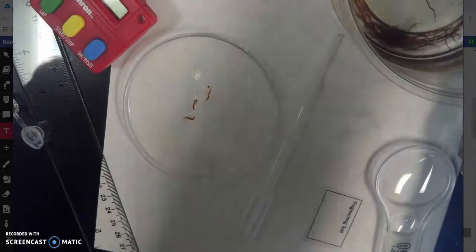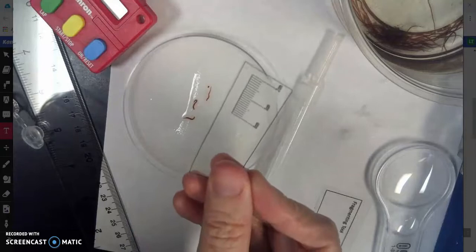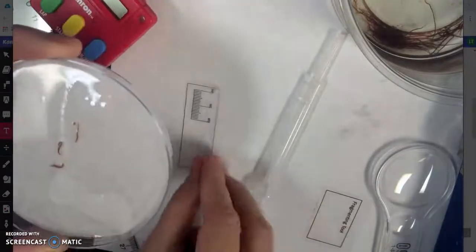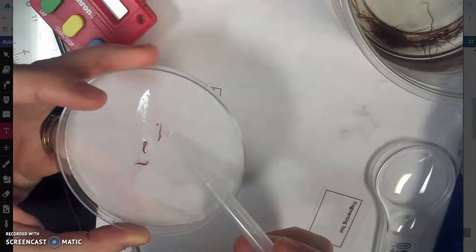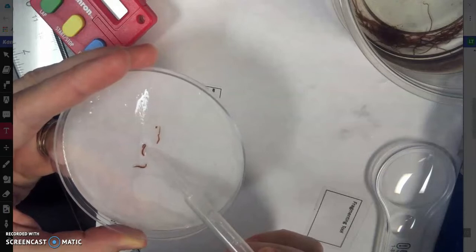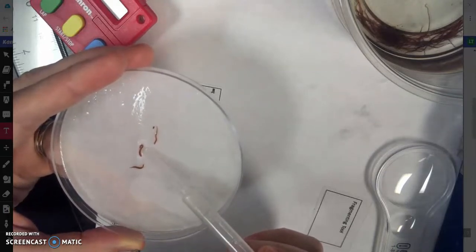Okay, now what we're going to do is we're going to measure each one of the pieces. And I'm going to use something similar to the fragmenting tool. I'm going to use this little transparent ruler, and we're going to measure. We're going to call this piece, piece 1, and that one will be used for class 701. We're going to do this piece as piece 2, and we'll use it for class 702.